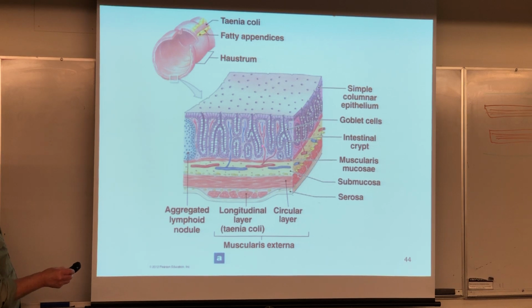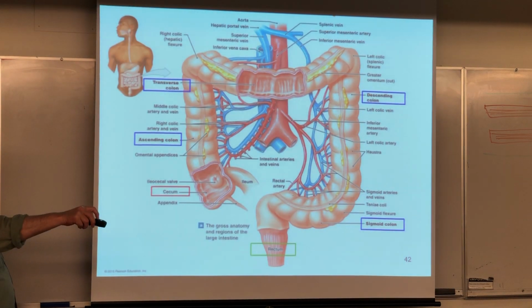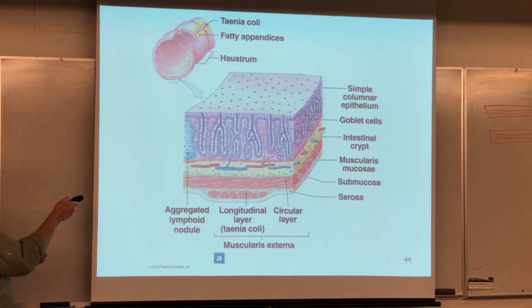And then I realized that there's lots of these little white cells that I really didn't have when I go back and look at the idea of, come on, goblet cells. Right in here. Yeah, I have a few goblet cells, but over here, lots and lots of mucus.